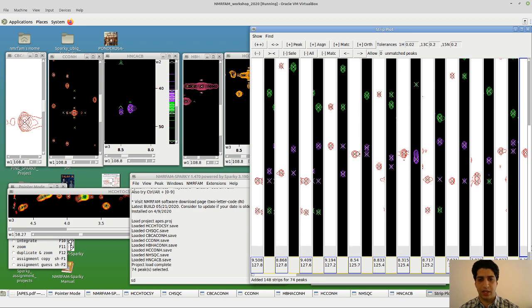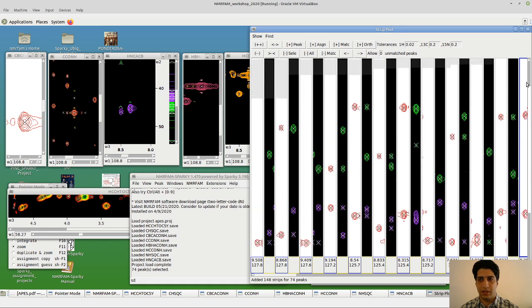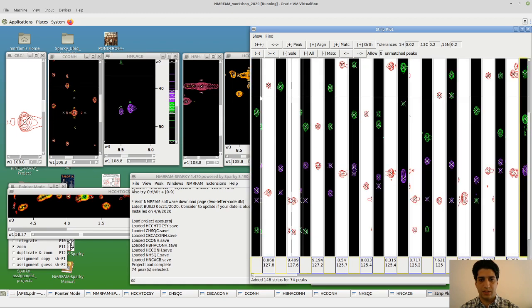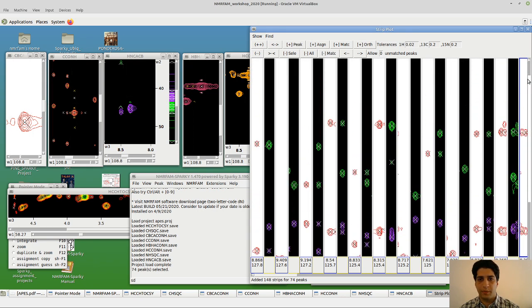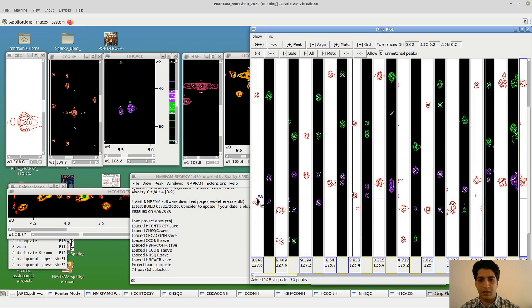Okay, you can see that we have 2 peaks and 4 peaks here. So this one is fine too. Just click here, SD, another SD, and that is gone. Okay, now we get to problem areas. We have 2 peaks here, but we have 3 peaks here.